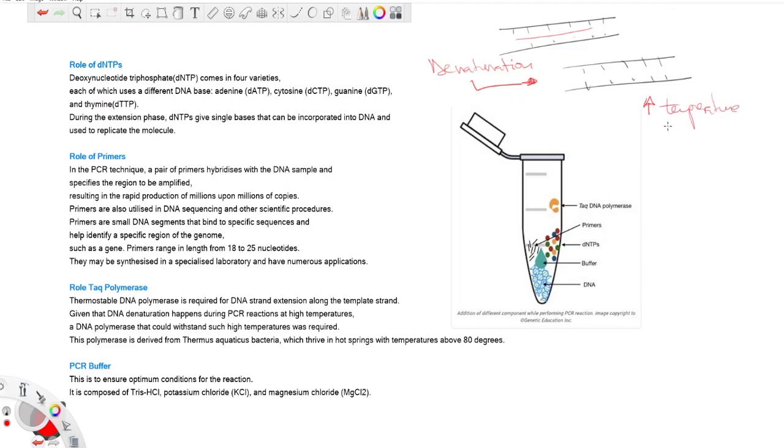And if there's one thing that we need to know about enzymes, it is that at high temperature, if that enzyme is not comfortable, it's not going to function. In fact, it may even become less functional or denature. All right. So our process, usually, as you see in the later stage, requires quite an increase in temperature.